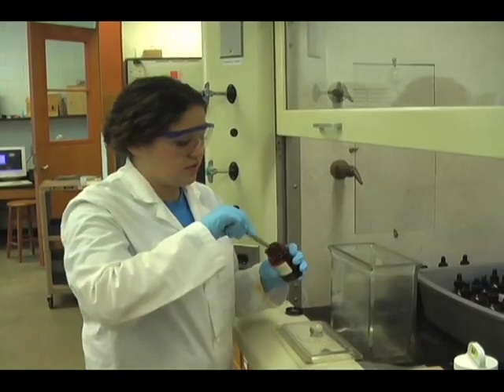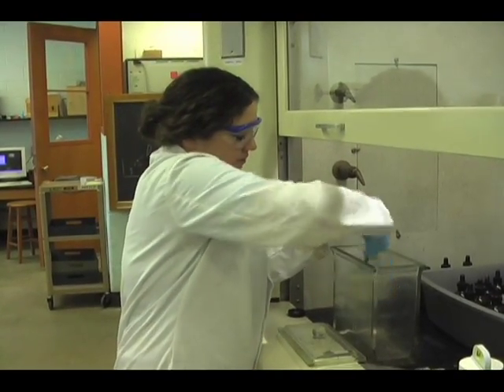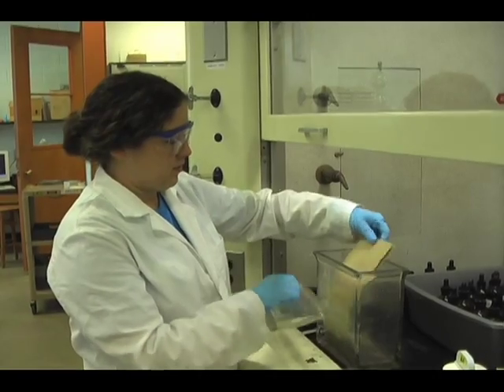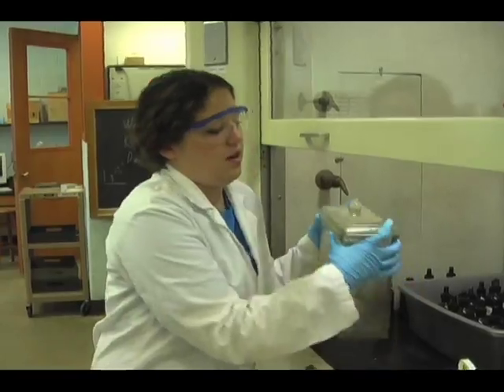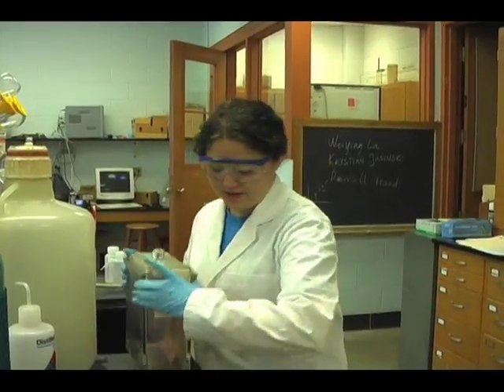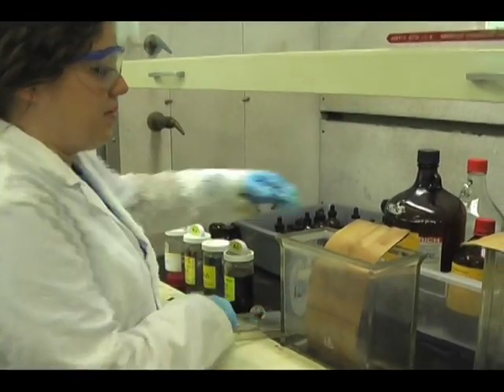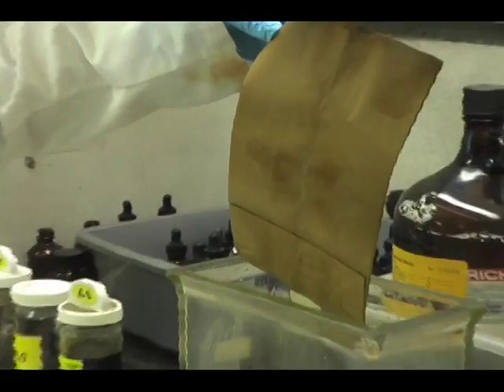Now I'm putting iodine crystals in to sublimate into the TLC chamber, placing the evidence in the chamber, covering it and putting it in hot water to speed up the process. Alright, it's been 10 minutes. We're going to check and make sure there are some fingerprints visible. And there are a few, so we'll dust them now.